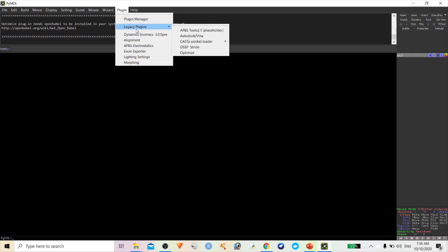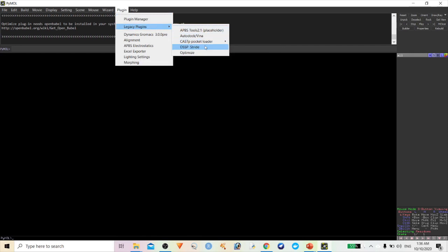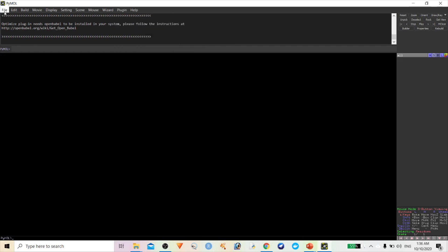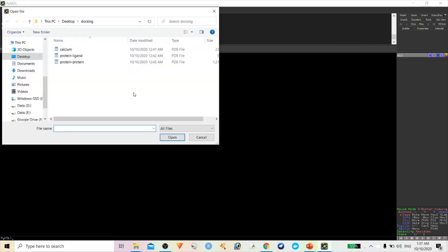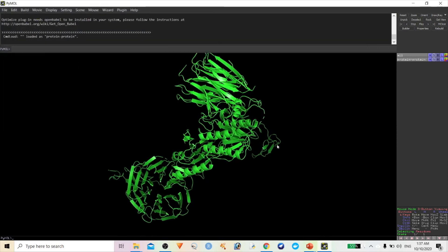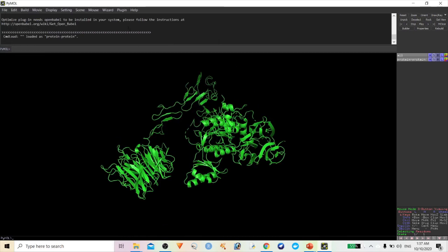You can see the various legacy plugins available: AutoDock, Vina, CastP, and many others to check the secondary structure of this protein. Let me demonstrate one. Click Open to load a protein, then go to Plugin.